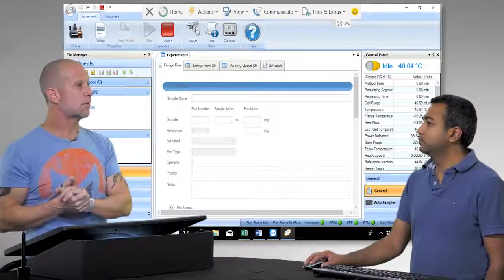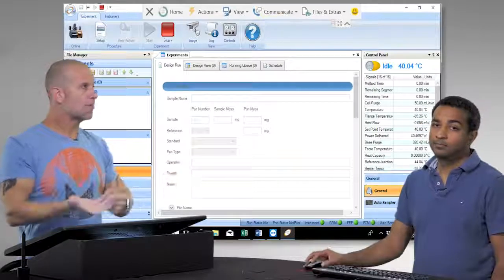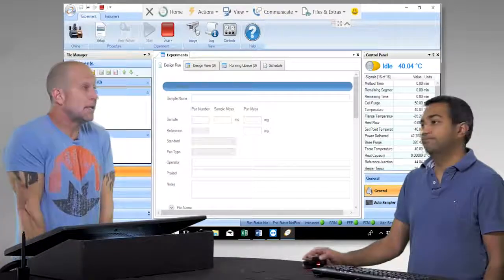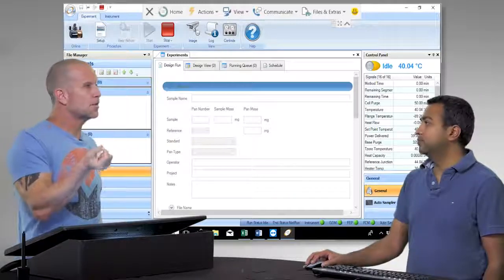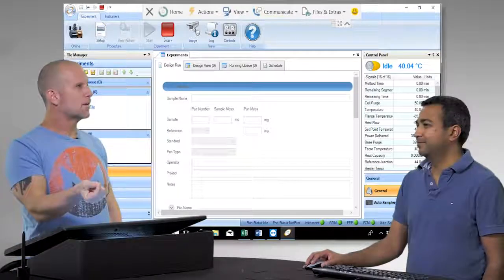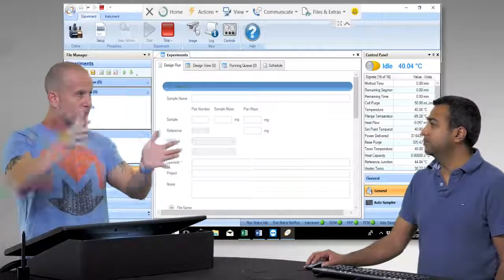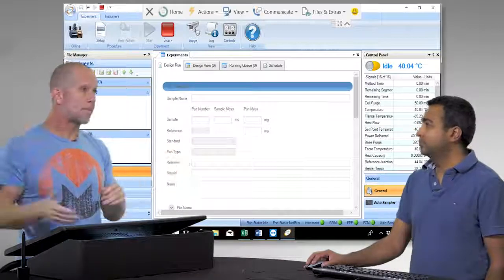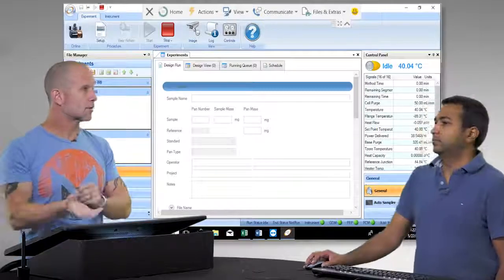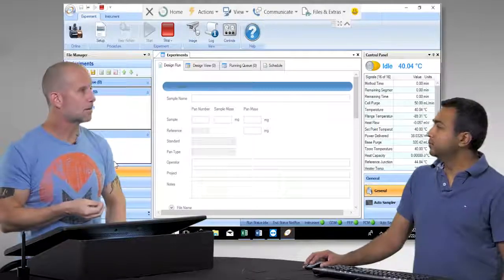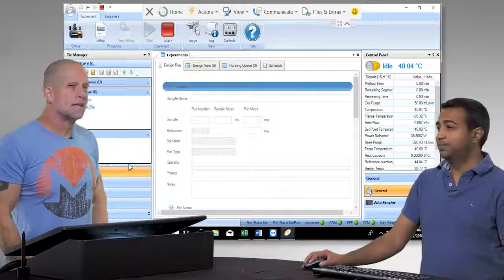Once you have your samples in the auto sampler, you can run them from there, but you can pull it up anywhere and set up any type of experiment. As long as the sample is still in the auto sampler, if you decide later you want to run a different experiment at a different rate, different calorimetry ramp rate, isothermal, et cetera — you can come back and set that up from anywhere.